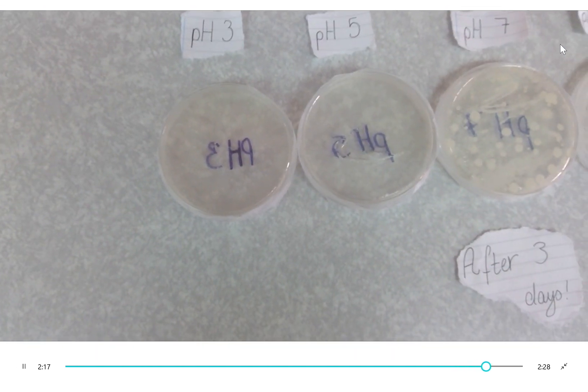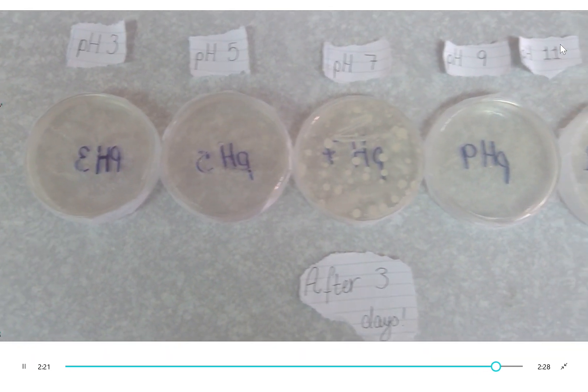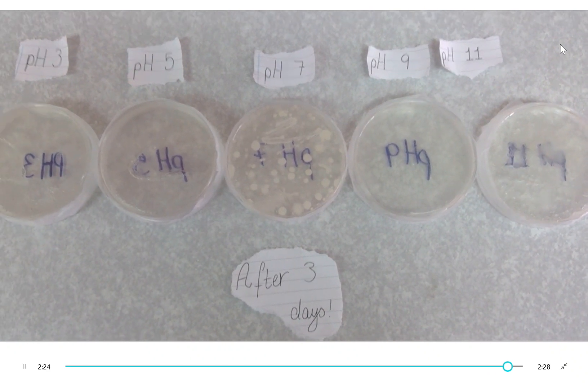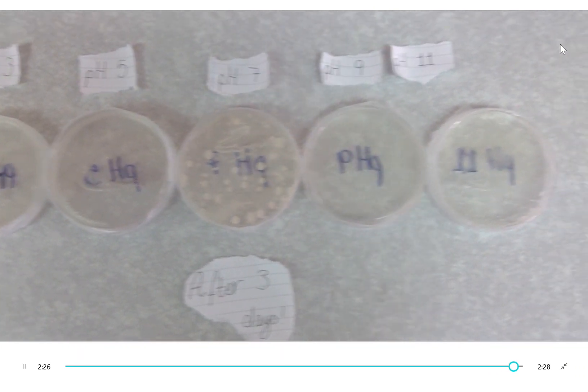In the last 3 days we checked our bacteria. It turns out that the bacteria only grew at the pH of 7. This is because your mouth has an average pH of 6.7, meaning that a neutral substance is the best condition for mouth bacteria to grow.